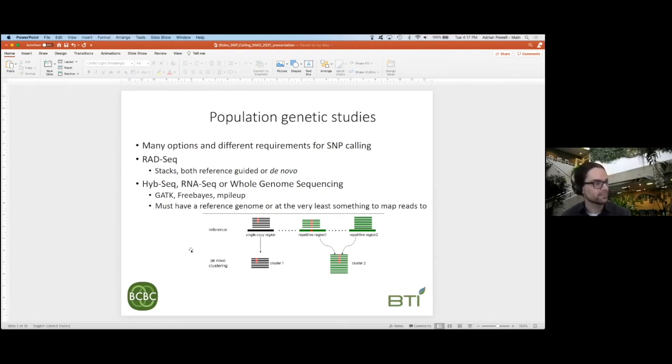I will make some reference as well, and it's covered in the detailed instructions. There are options for de novo clustering of sequence data, even if you don't have the reference. I think most of the examples focus on having a reference because with Jacob and Susie's assistance, you have now developed your reference for your non-model species. So you should be okay on that front.